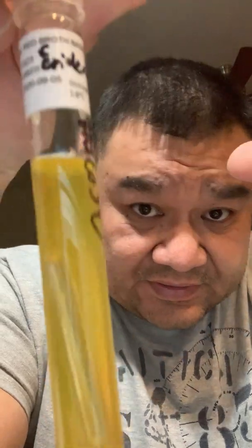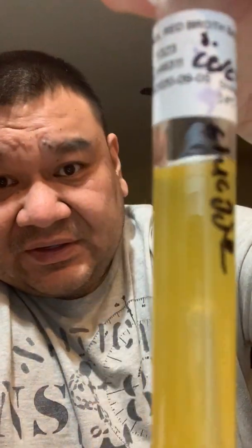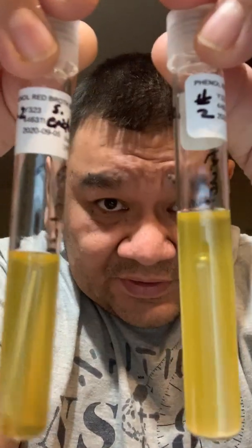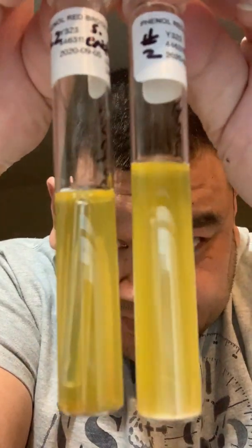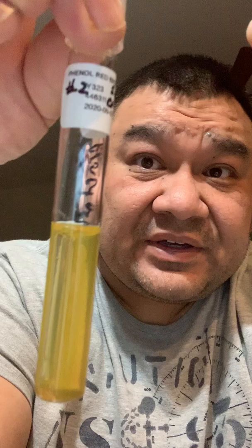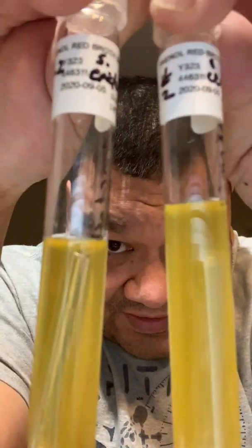This is the glucose epidermidis, glucose cerevisiae. There's both of them. Fructose. This one right here is the epidermidis, and cerevisiae right there.